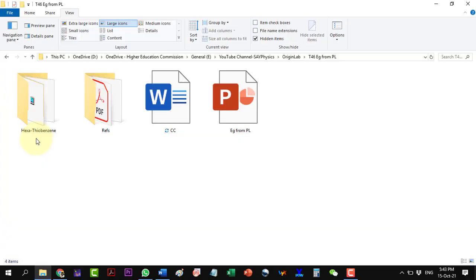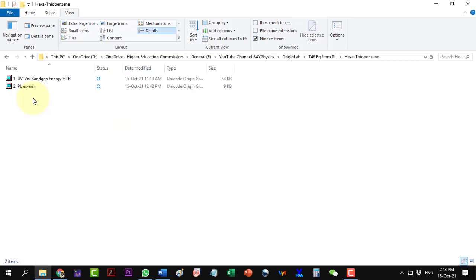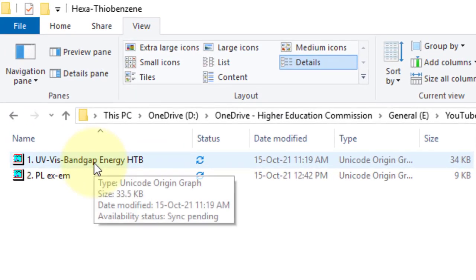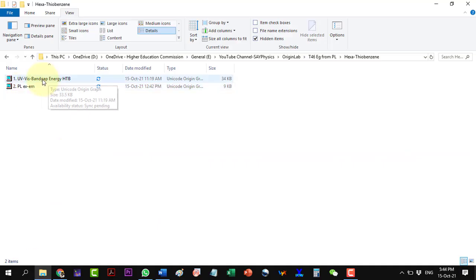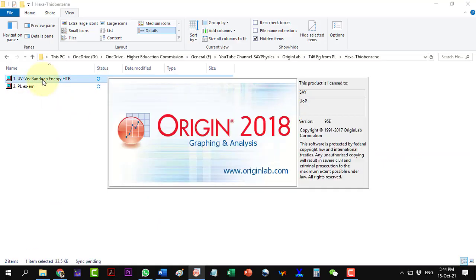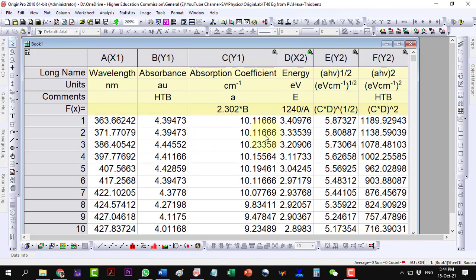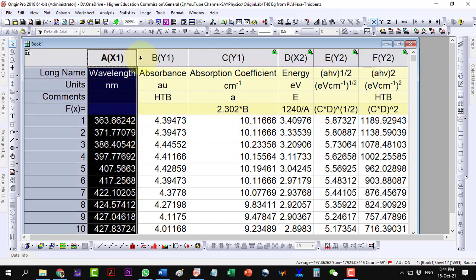Now, let us start with the calculations in OriginLab. This is the hexathiobenzene. Here we have the UV-Vis data from which we can calculate the bandgap energy in order to compare it with the PL data calculations. First, let us open the UV-Vis data. This is the data with some calculations for the bandgap energy, which we have already discussed in the above appearing video link. Plot the absorption data first.